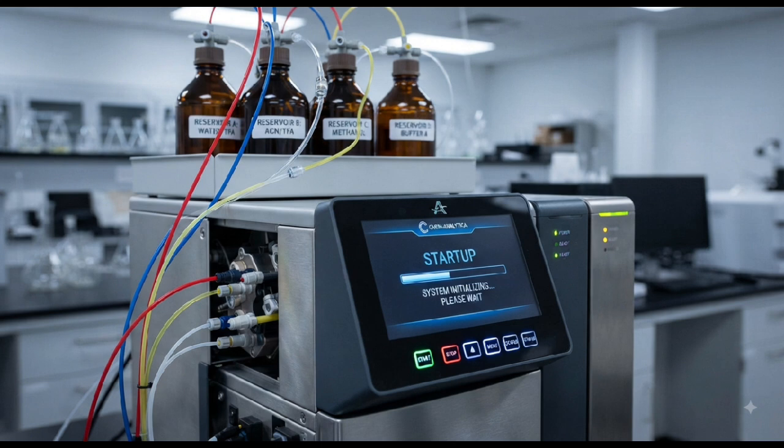HPLC system startup. Before starting the analysis, the HPLC system is checked for proper connections, solvent availability, leaks, column leakage, and instrument status. The appropriate mobile phase is placed in the solvent reservoir and the solvent lines are properly primed.